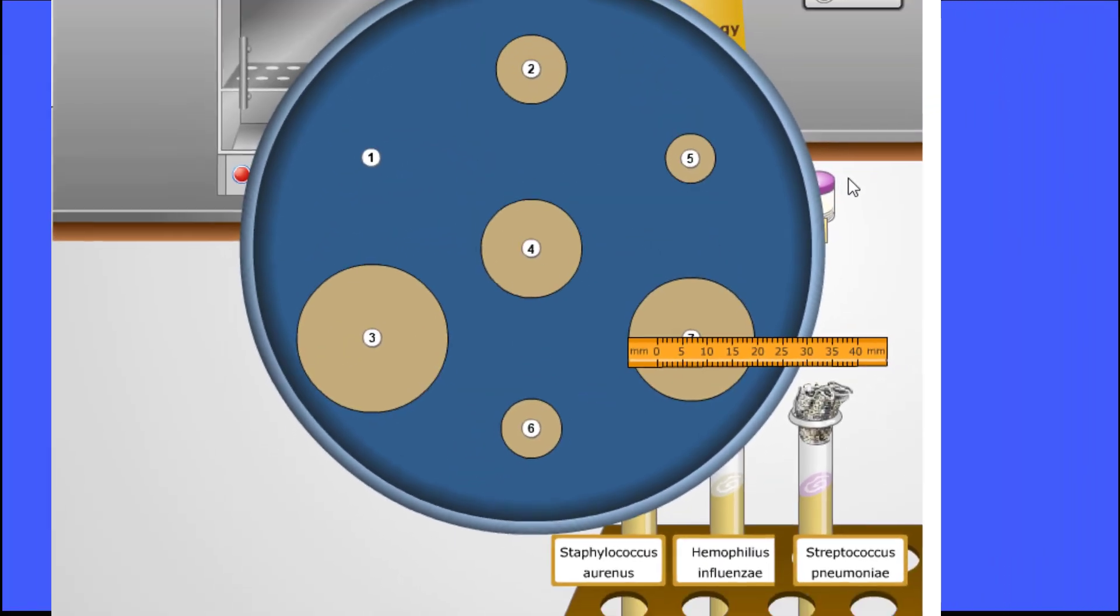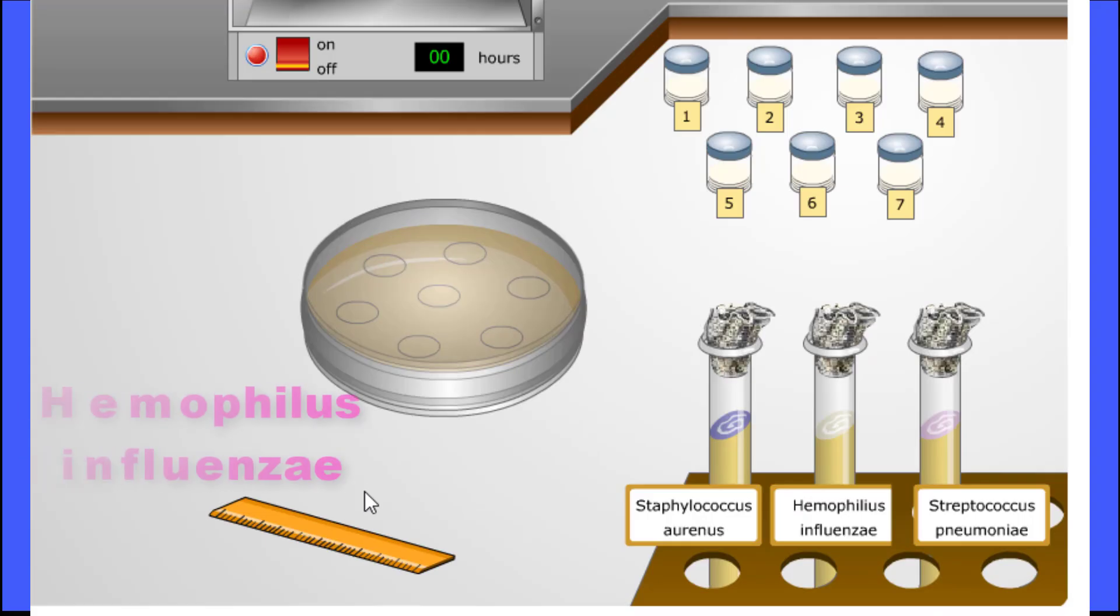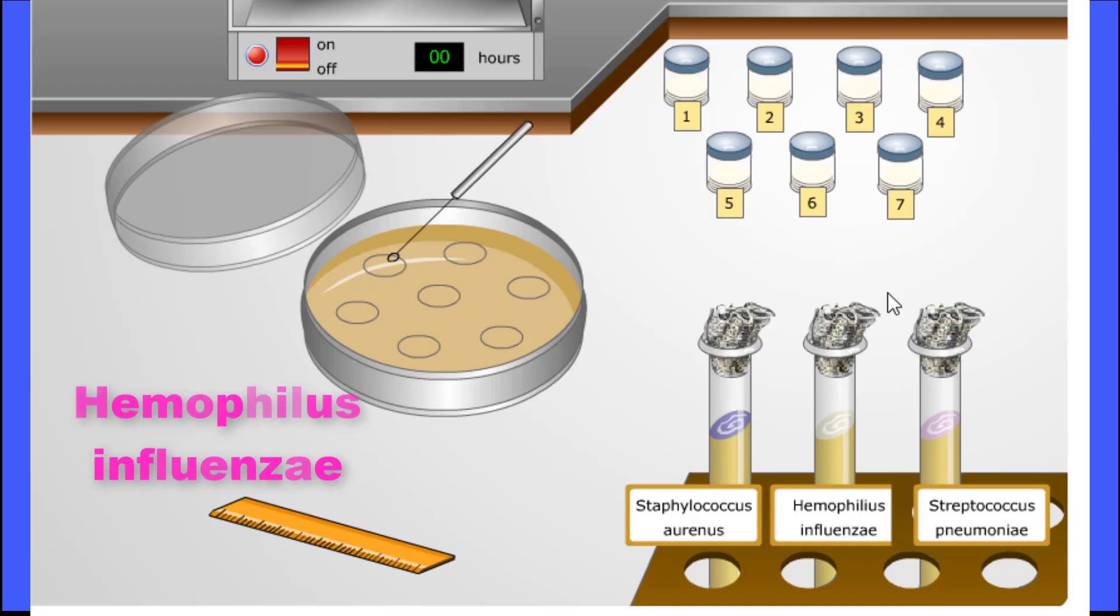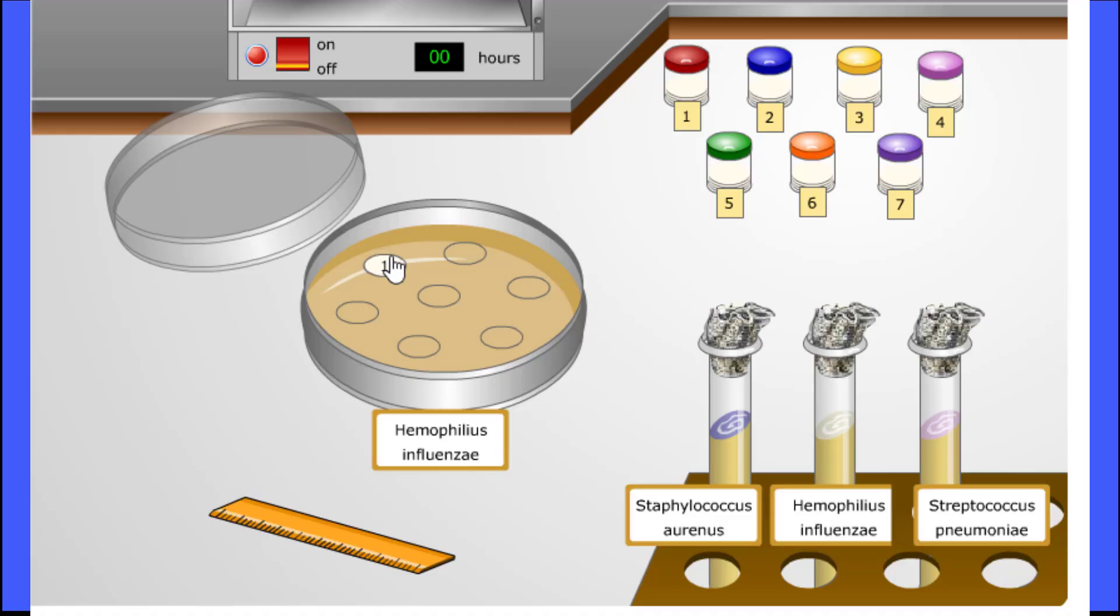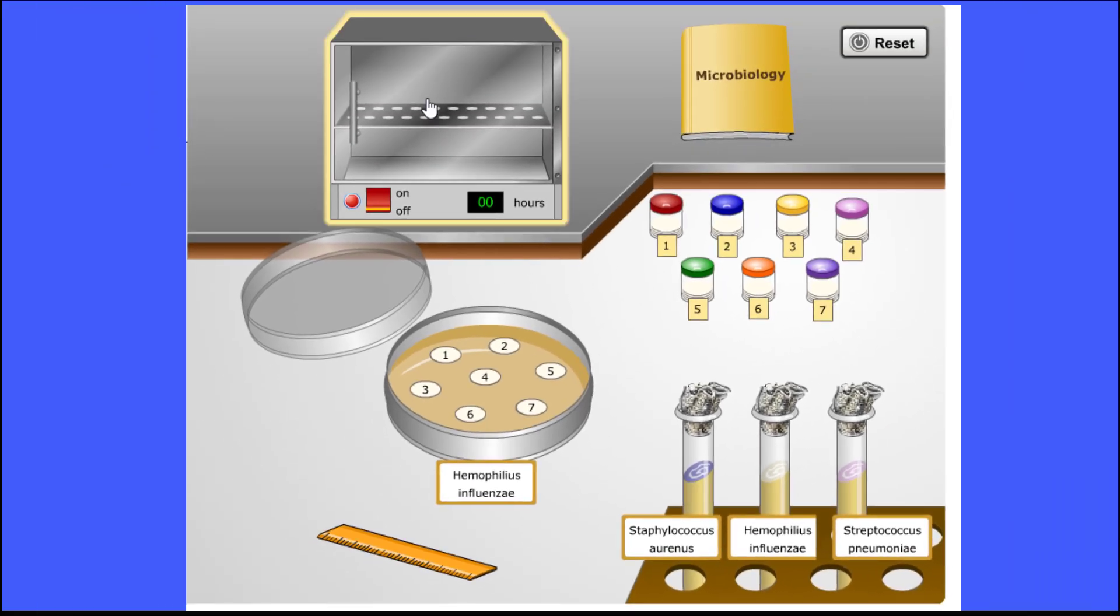Now we reset our experiment and try Haemophilus influenzae. Let's inoculate our plates and add our discs. Now we're going to incubate our petri plate for 24 hours.